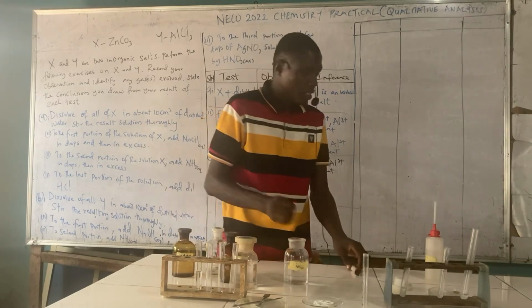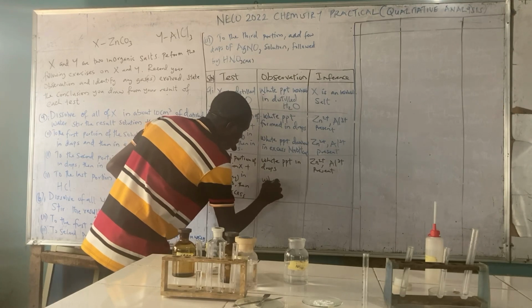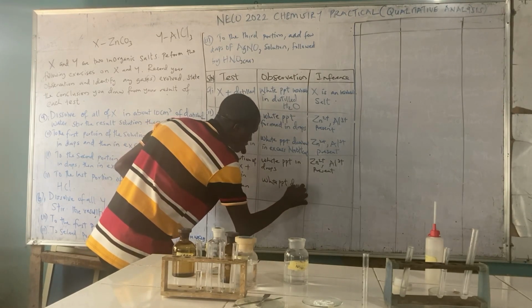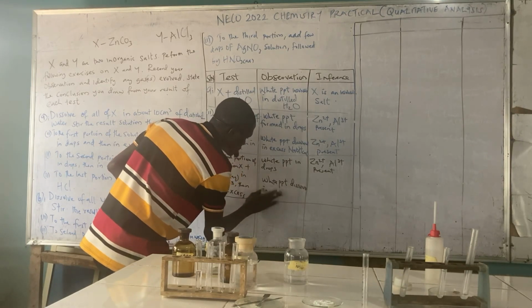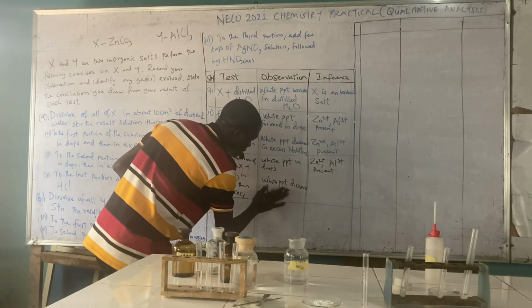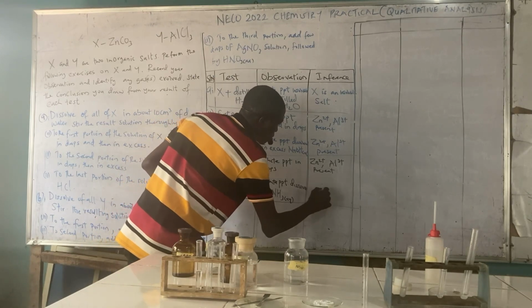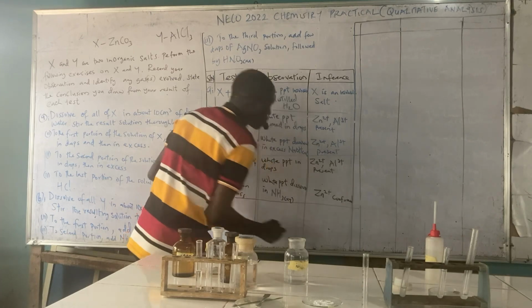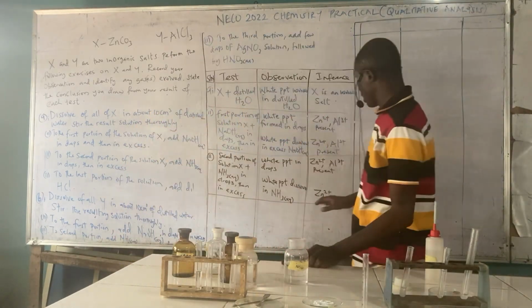So meaning that white PPT dissolves in excess aqueous ammonia. So meaning that zinc 2+ confirmed.